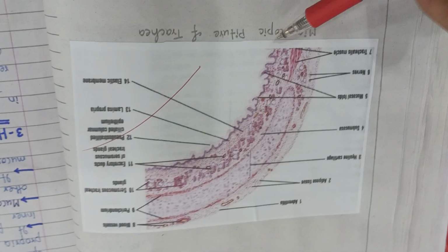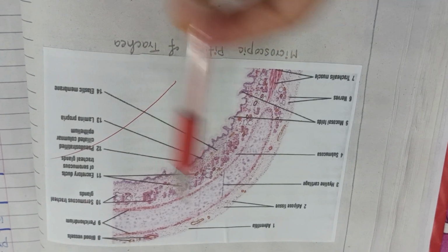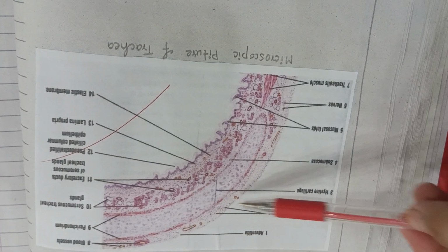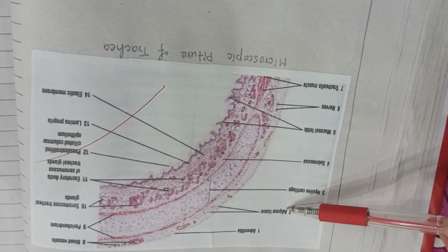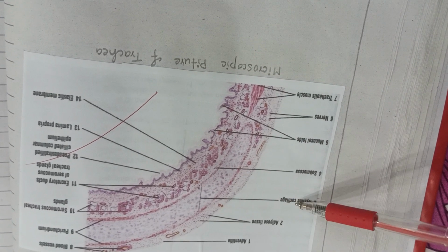Now I am going to show you the picture of the layers of the trachea. This is the trachea under the microscope. Now you can see the outermost layer. This outermost layer is the adventitia. It has some fat cells in it, which is called adipose tissue. Then after it, this is the hyaline cartilage. This whole part is the hyaline cartilage.